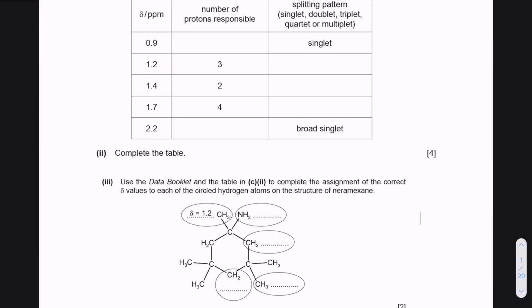Let me revise it for you a little bit. The number of protons, which is also called the height or the density, tells me how many of the protons have the same environment. When I was teaching, I used to call them adjacent. So if I have CH3, 3 means there are 3 hydrogens with the same environment. Here at 1.2, CH3 means there are 3 protons, 3 hydrogens with the same environment. But 2 means two have the same environment. They could be these or these. We will find out from the value table. And they could also be this.